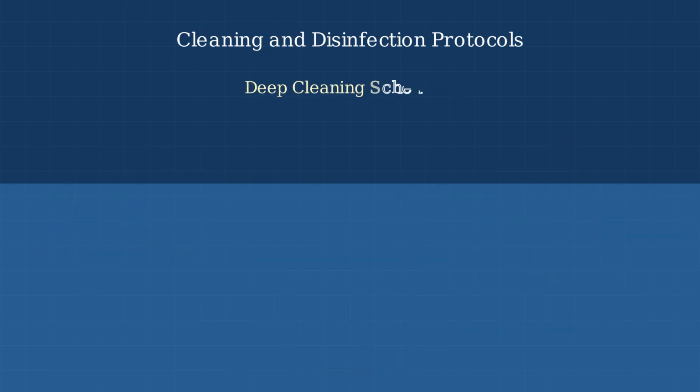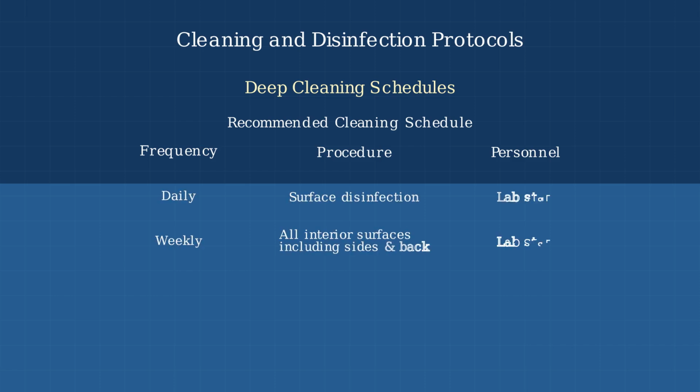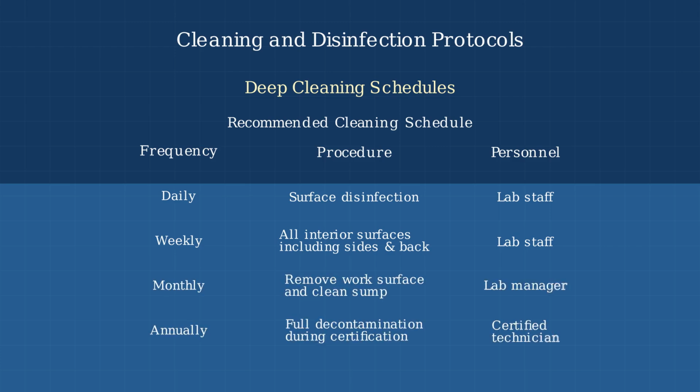Regular deep cleaning schedules are critical for maintaining biosafety cabinet performance beyond daily disinfection procedures. Daily cleaning involves surface disinfection of the work area by lab staff. Weekly cleaning should include all interior surfaces, including sides and back panels. Monthly procedures should include removing the work surface to clean the sump below, typically performed by the lab manager. Annual deep cleaning coincides with certification and should be done by a certified technician.